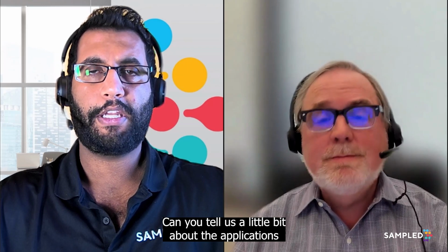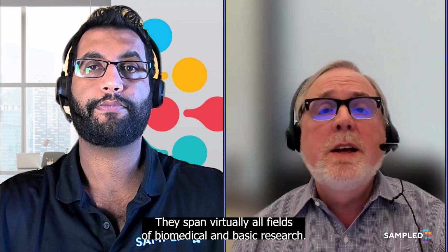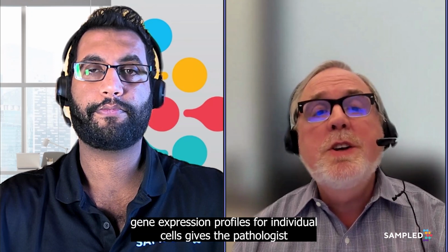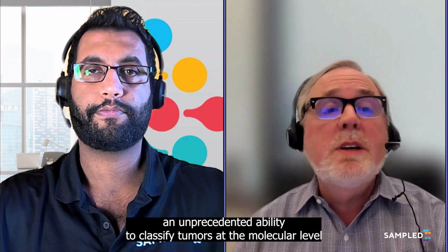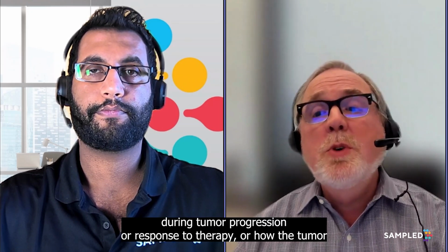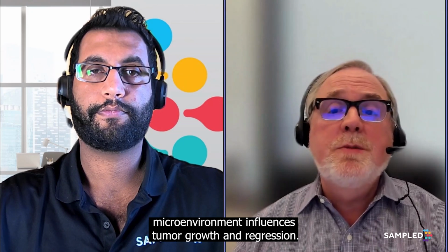Great. Can you tell us a little bit about the applications of single cell RNA sequencing too? Oh, there are a great many. They span virtually all fields of biomedical and basic research. I touched on tumor biology before. The ability to generate gene expression profiles for individual cells gives the pathologist an unprecedented ability to classify tumors at the molecular level and allows us to look at things like gene expression changes during tumor progression or response to therapy, or how the tumor microenvironment influences tumor growth and regression.